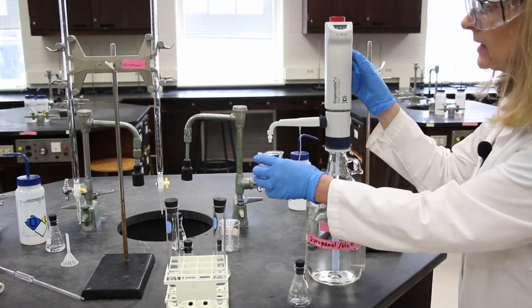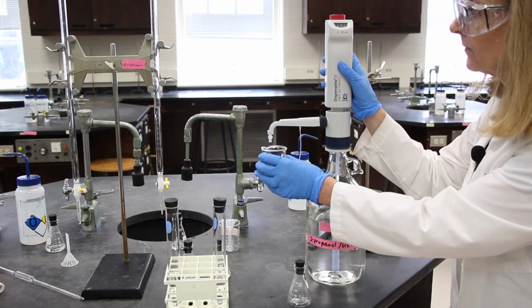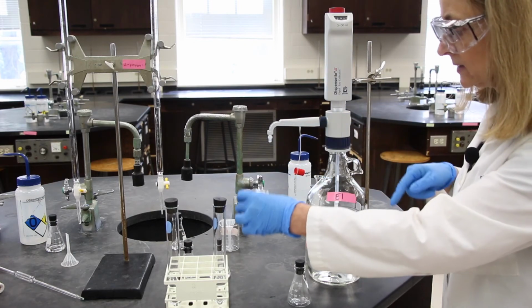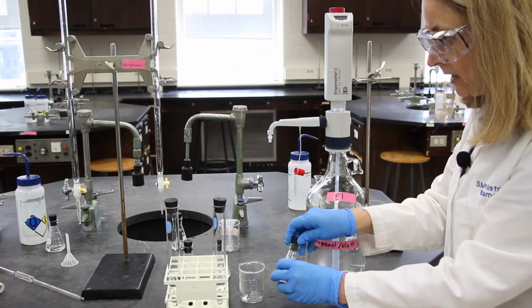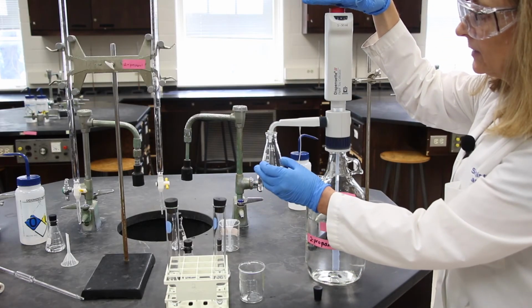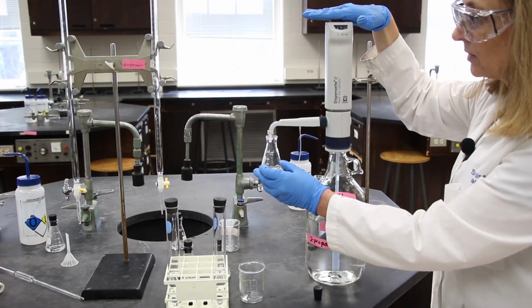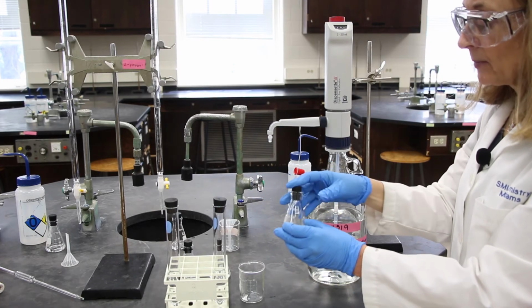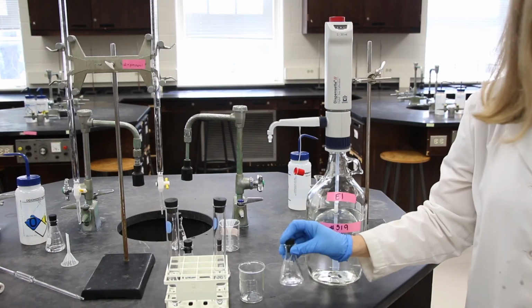First, we'll gently lift up on the barrel, and if there's a drop that comes up, it will go to our waste beaker. Then I will gently push down and deliver the solution to our Erlenmeyer flask. I'll stopper it and reweigh it.